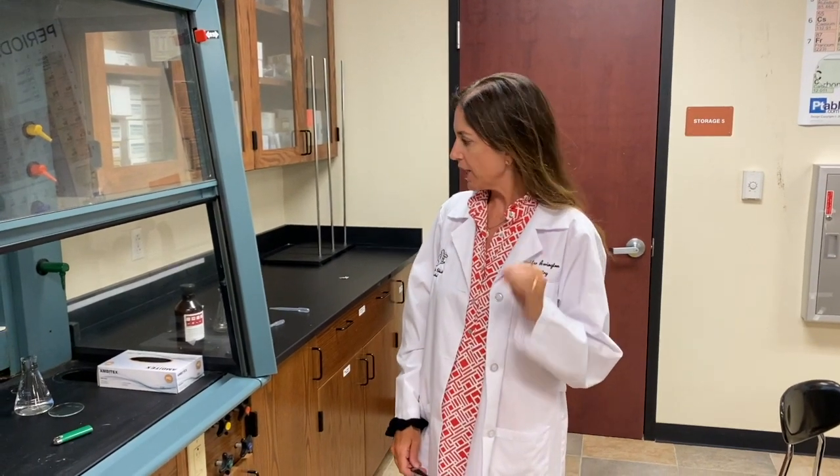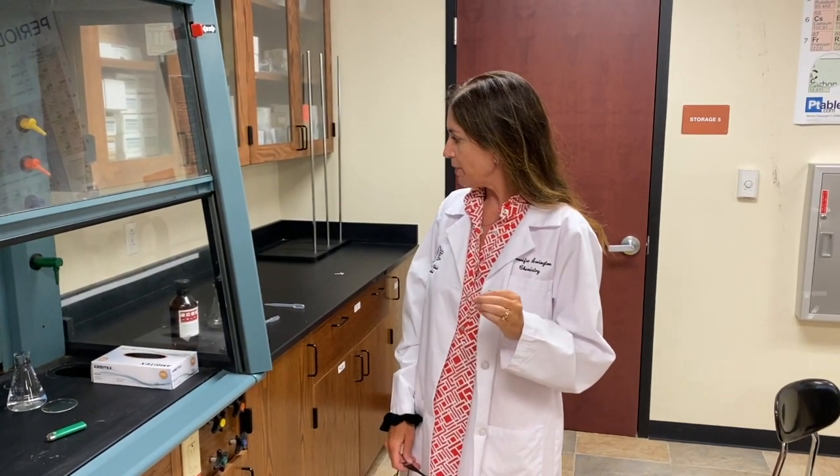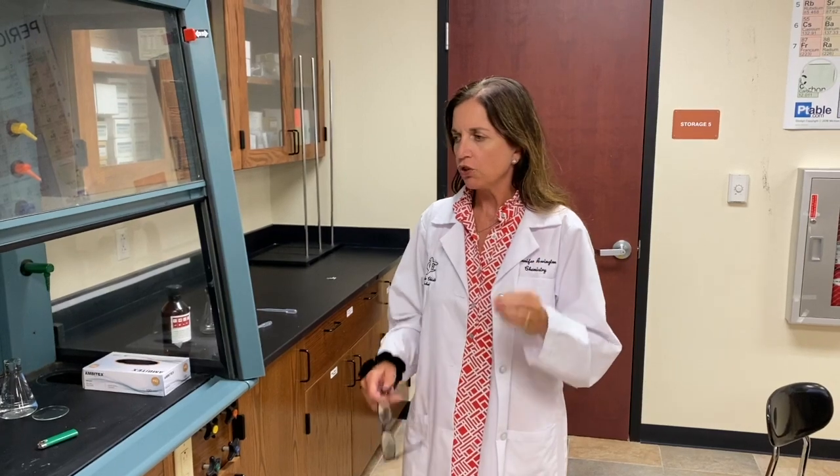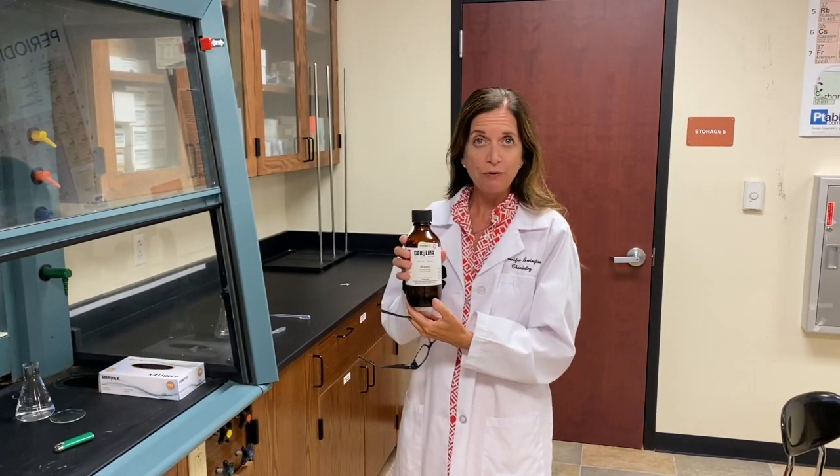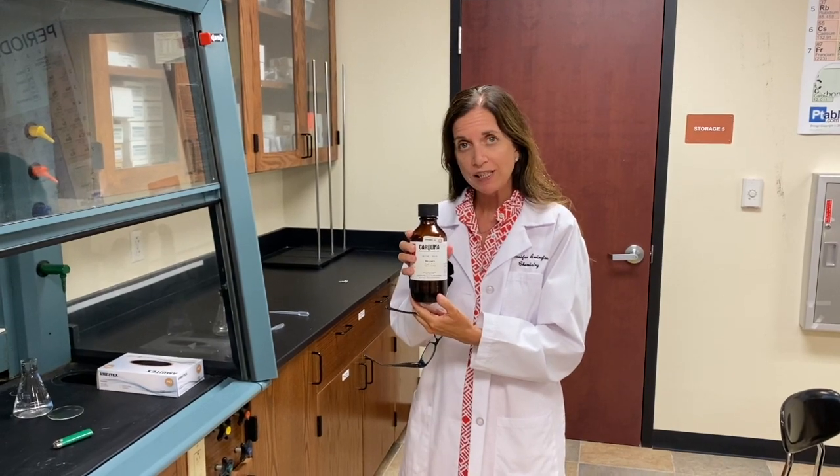Hey guys, Chem Jen is back. Welcome to a new school year. Today we are going to be talking about safety, and I particularly want you to know about how important it is not to have a flammable liquid around a flame — and I'm going to show you exactly why.